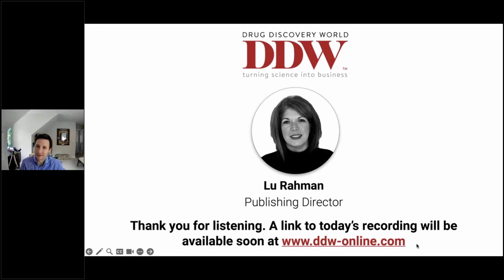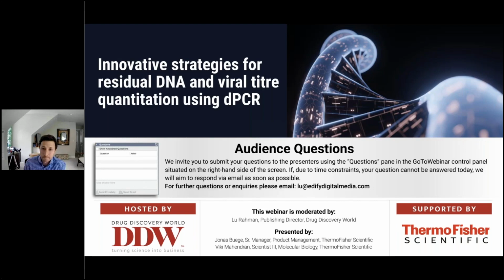Yes, thank you, Lou. Great, okay. So the first question is, can the same results be expected for the same assay on qPCR and dPCR? If we have the same assay, and you are using a qPCR and a digital PCR instrument, then I would say the same results can mostly be expected, with a little asterisk here.